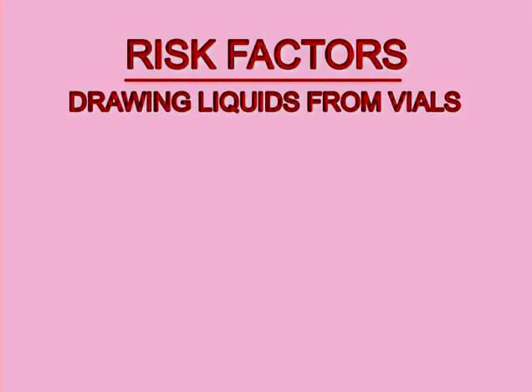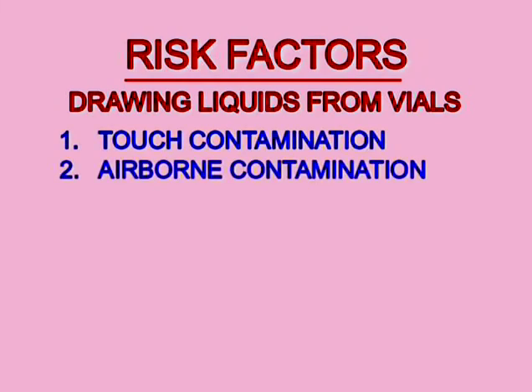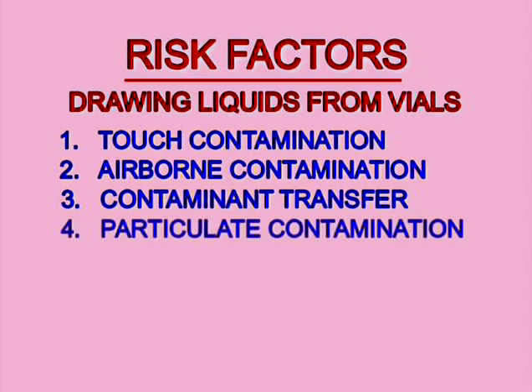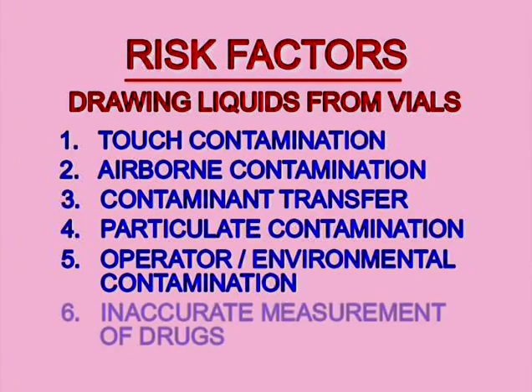Risk factors are as follows: 1. Touch contamination. 2. Airborne contamination due to disruption of first air. 3. Contaminant transfer from the surface of the septum. 4. Particulate contamination due to coring. 5. Contamination of the operator and the environment with drug residue. And 6. Inaccurate measurement of drug product leading to incorrect dosing.